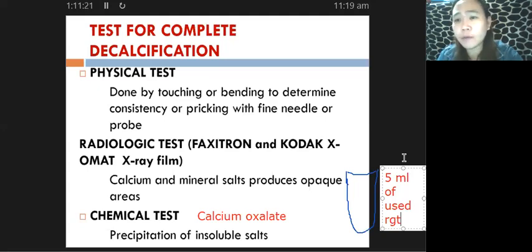So how do we perform alkalinization? What litmus paper do we use? Yes, very good, either. You have to make use of your litmus paper. Say for example, you use blue litmus paper.